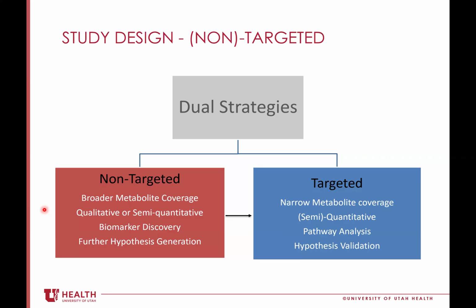All right. So the targeted approach is also hypothesis validation. So if you saw something different, and going back to Bruce's question, a lot of times non-targeted isn't really sensitive. So you might see a change in the most abundant metabolites in that particular pathway, but you don't always observe the other metabolites in it. So you can take your hypothesis, oh, the TCA pathway is altered. We only saw changes in citrate. You do a very targeted approach, and with the targeted approach, you hit all the other enzymes in that particular pathway.